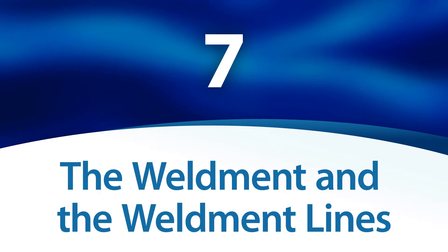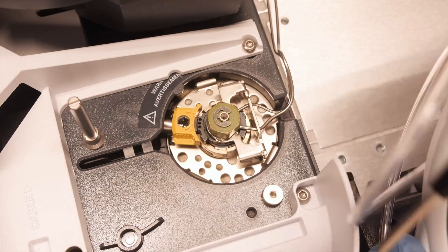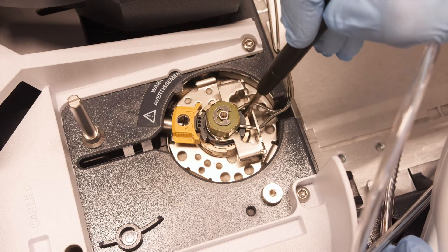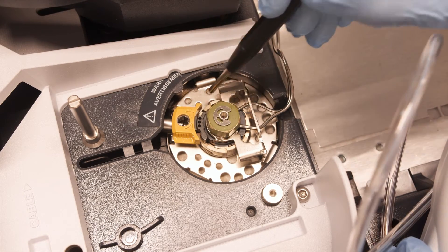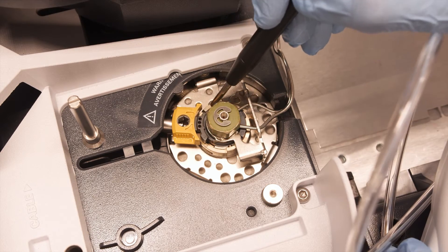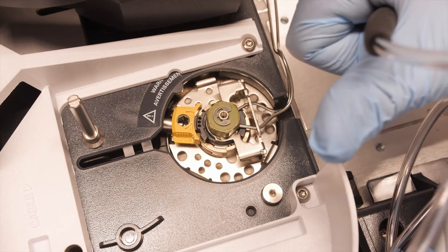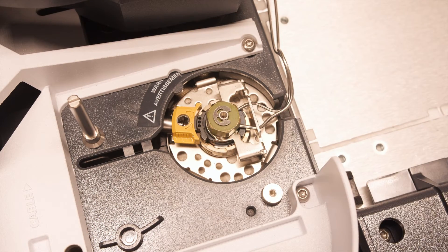The weldment and the weldment lines. Check the weldment for leaks. If you detect a leak, it may be the result of an incorrectly tightened weldment — if so, retighten it. If a leak is still present or detected around the weldment lines, it could indicate the presence of cracks. In this situation, the weldment should be replaced.